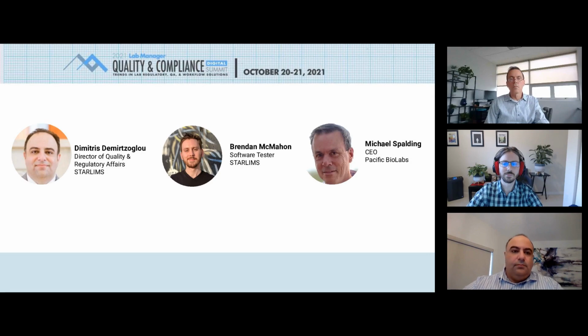Lab managers can utilize different tools and ideas to make their jobs easier and help them to meet or exceed their required standards. Welcome to this session, Removing the Barriers to Obtaining and Validating a LIMS. Achieving compliance with GxP and ISO standards while maximizing efficiency are key priorities for most laboratories. However, the time and resources required to obtain and validate a LIMS can be a barrier for many labs.